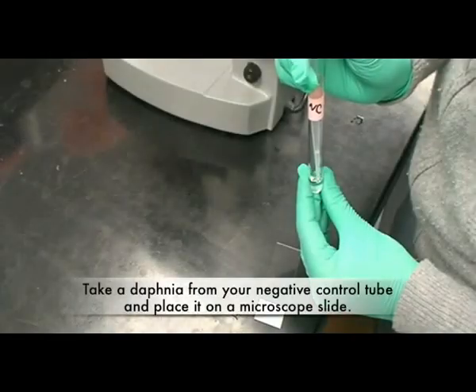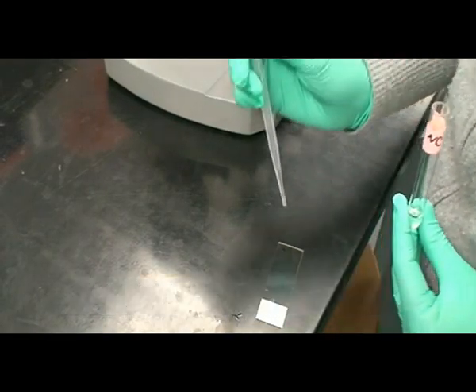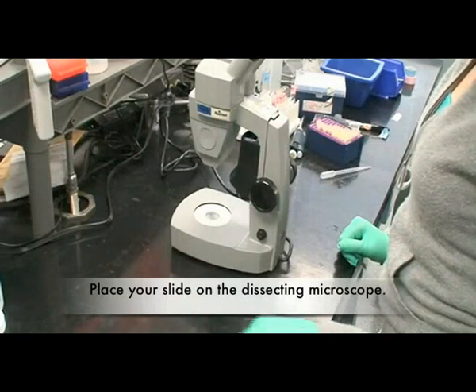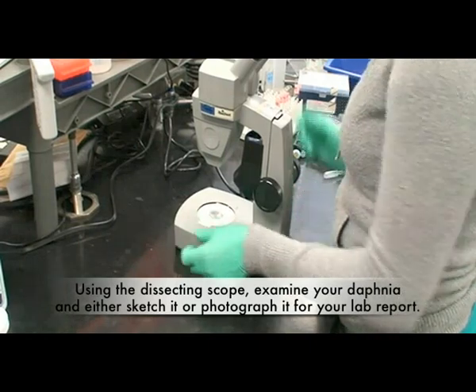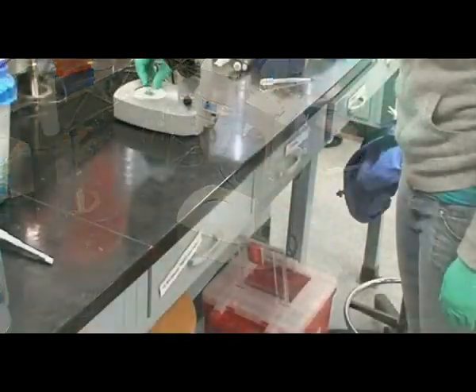Take a Daphnia from your negative control tube and place it on a microscope slide. You can also look at specimens from other tubes if you feel it might help you prove your hypothesis. Place your slide on the dissecting microscope and examine your Daphnia, then either sketch it or photograph it for your lab report.